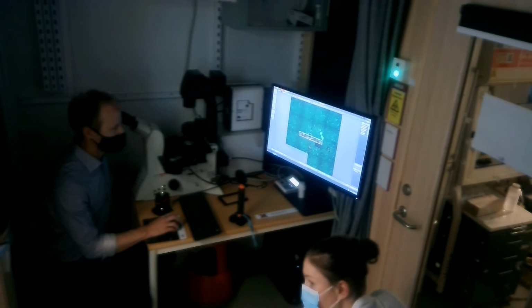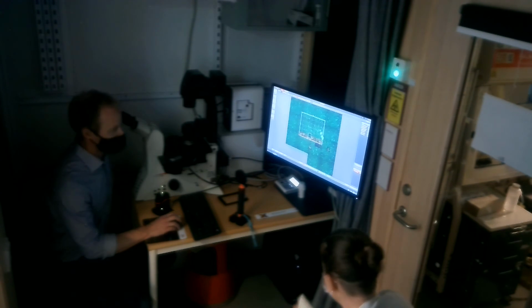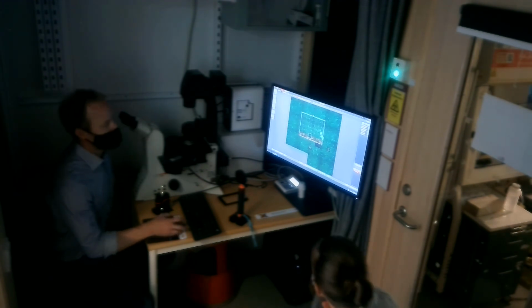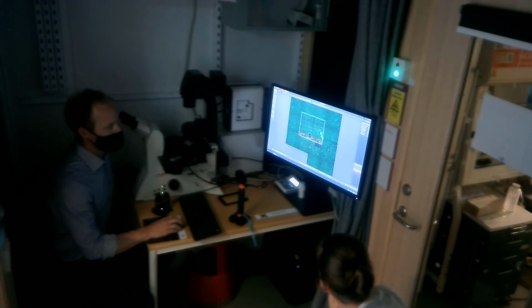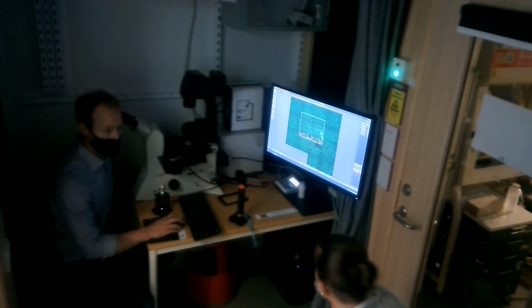I know that the main profile of this one is not the microscopic scanning, but isn't there an option for that, just to make the automatic focus points? Yes, we're coming into that too. So if you have something like this, you can also set up a focus map, but then you might need 3 points, for example, or sometimes even more points.